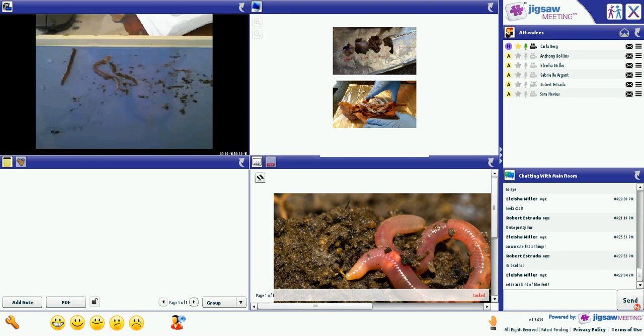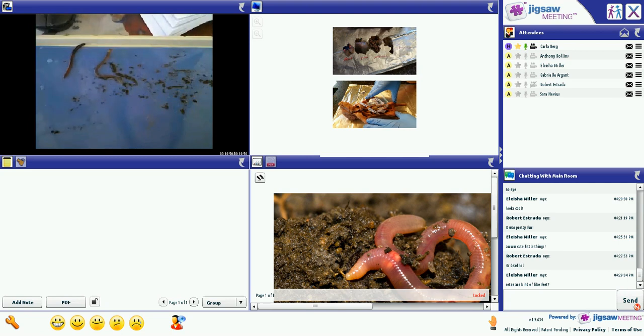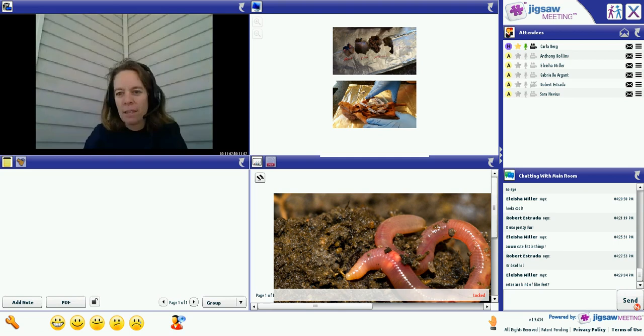Now I'm going to take my finger and touch the posterior end of my worm. And when I touch the posterior end of that worm, he tries to get away. Is anyone's worm having a different response than mine? If you do, go ahead and raise your hand and you can share with us.